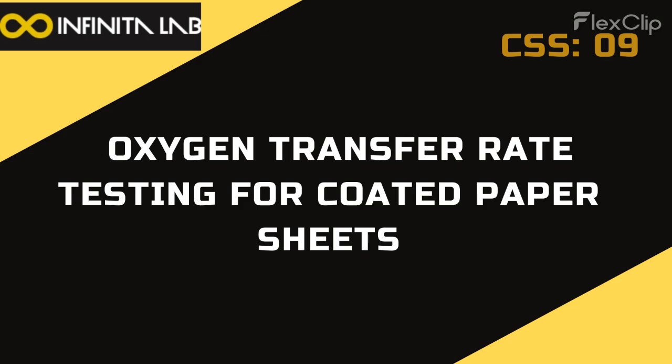And in this case study we're looking at today, this company wanted to figure out the oxygen transfer rate of their fancy new coated paper sheet. But there was a catch. Uh-oh. They needed to know the OTR at a very specific condition, 0% humidity. Whoa. Okay. 0% humidity. That seems like a really specific requirement. Why does it matter? I mean, does a little moisture in the air really change things that much?